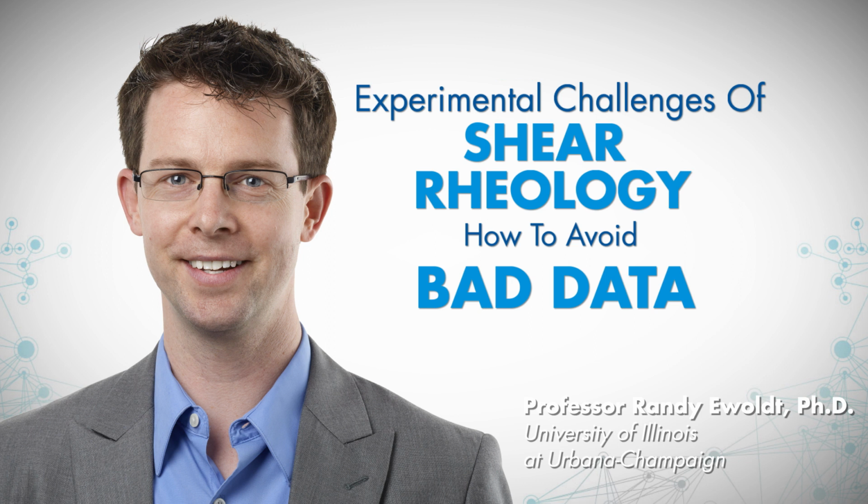And so if your viscosity is high enough, you're not limited any longer by the low torque or the Reynolds number limit. You're more limited by edge fracture, which was shown towards the end for the polymer melt, the viscoelastic putty. And maybe you're not limited by a low torque limit on the lower end, but you might be limited by how low a velocity you can measure, which wasn't commented on for any of these systems.